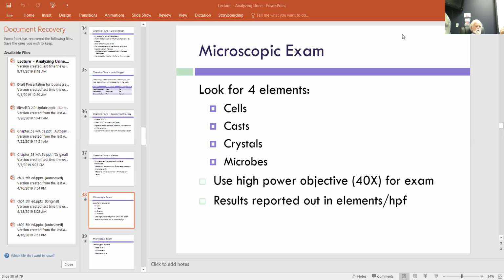Some number of cells is normal in a urine sample, because it's part of the filtration mechanism. Larger numbers, and that usually is in the range of about 5 cells in a view, in the little circular view that you could see through the microscope. You don't go probing around and counting them throughout the whole image. We're looking at just that static field.